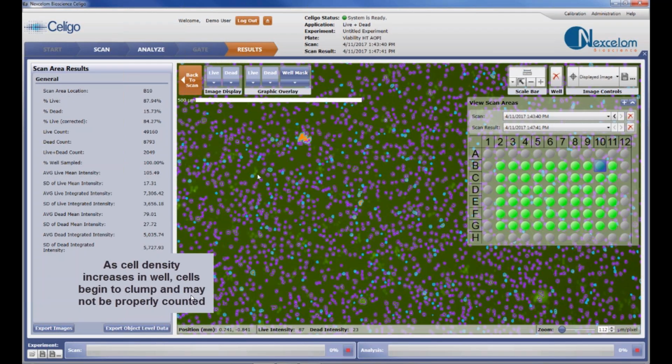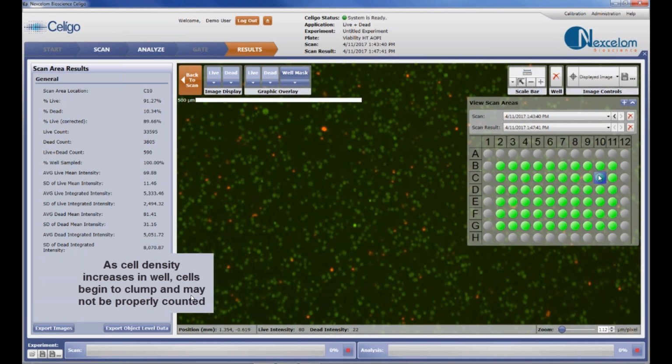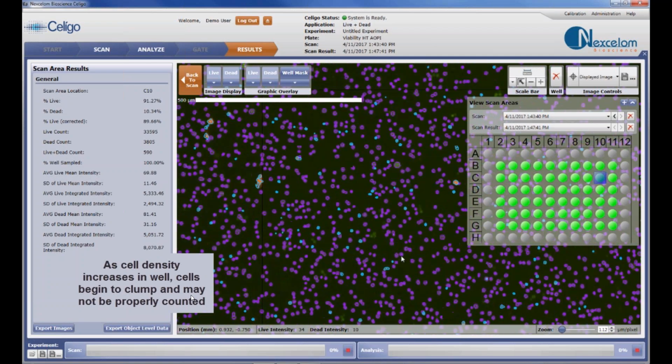This is the highest concentration we plated. It was supposed to be 10 microliters of the 8 million cells per mil, and then we have a twofold dilution into this row C. So this allows you to see when you have a higher concentrated sample, just by diluting it out, you start to see where you can have a little bit more confidence that your cell counting is accurate because it's a little bit more diluted.